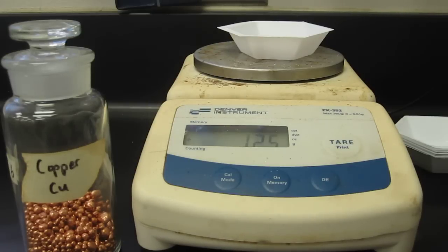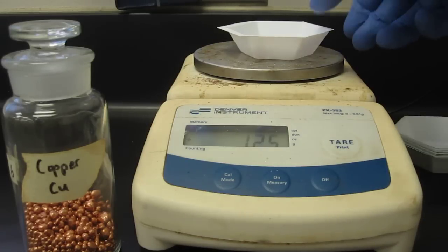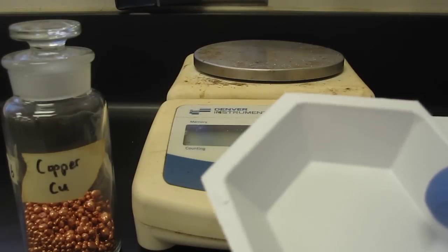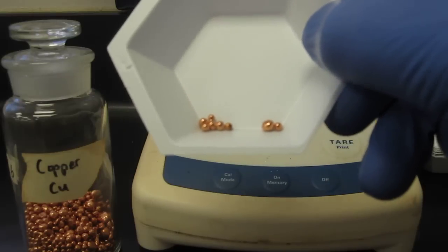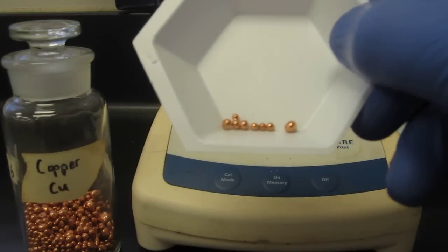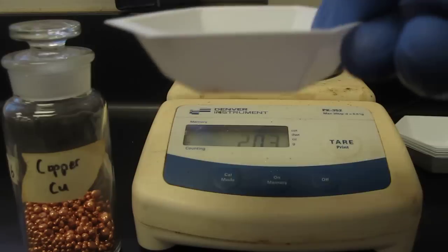Okay, so hopefully you've seen here that there are two types of numbers involved in weighing this particular type of substance, right? We can see that there's an exact number. There is exactly 8 balls of copper shot that we're measuring.